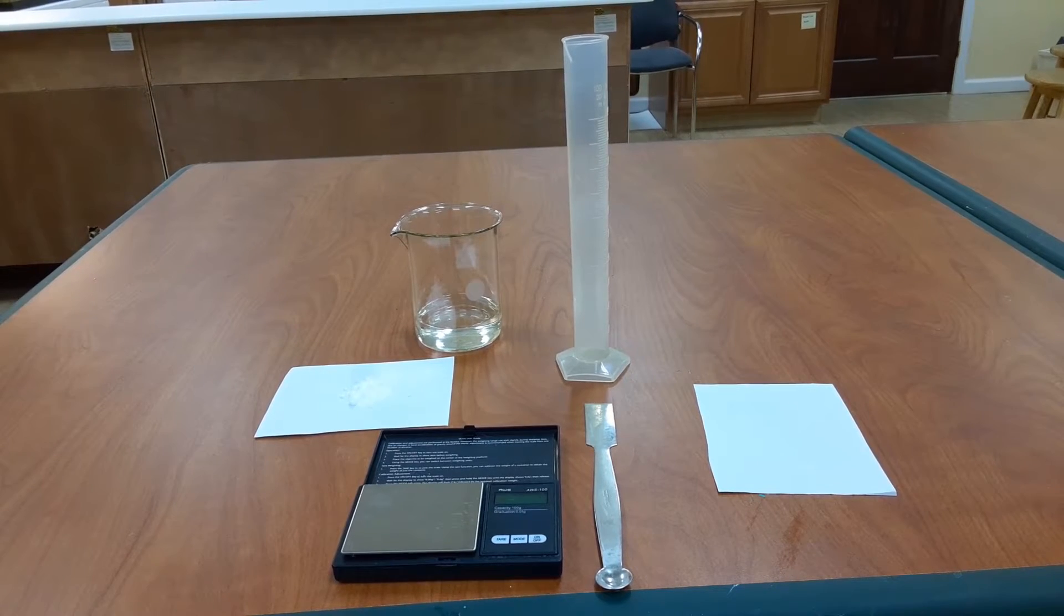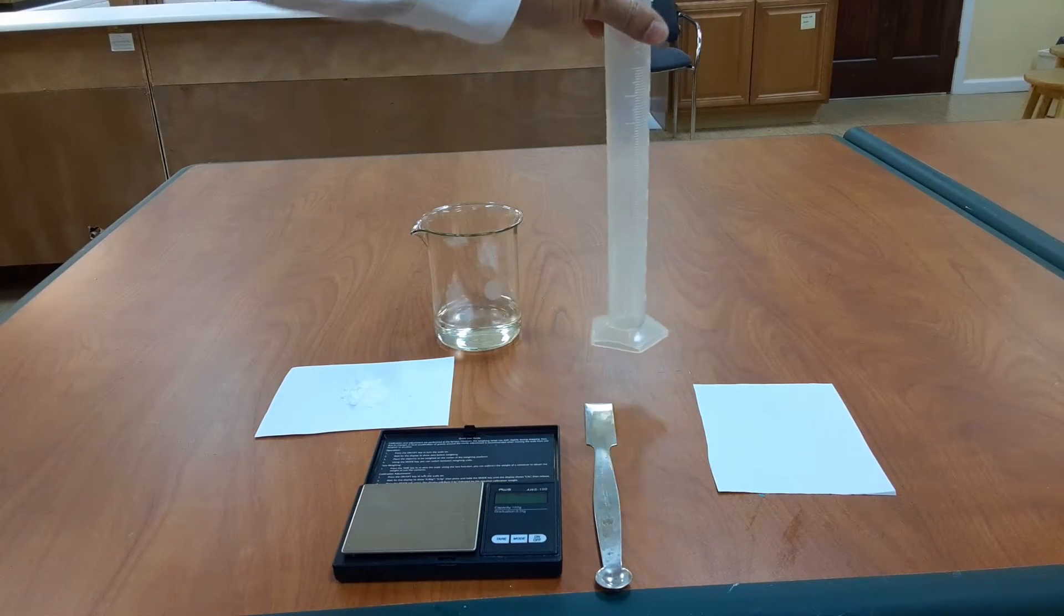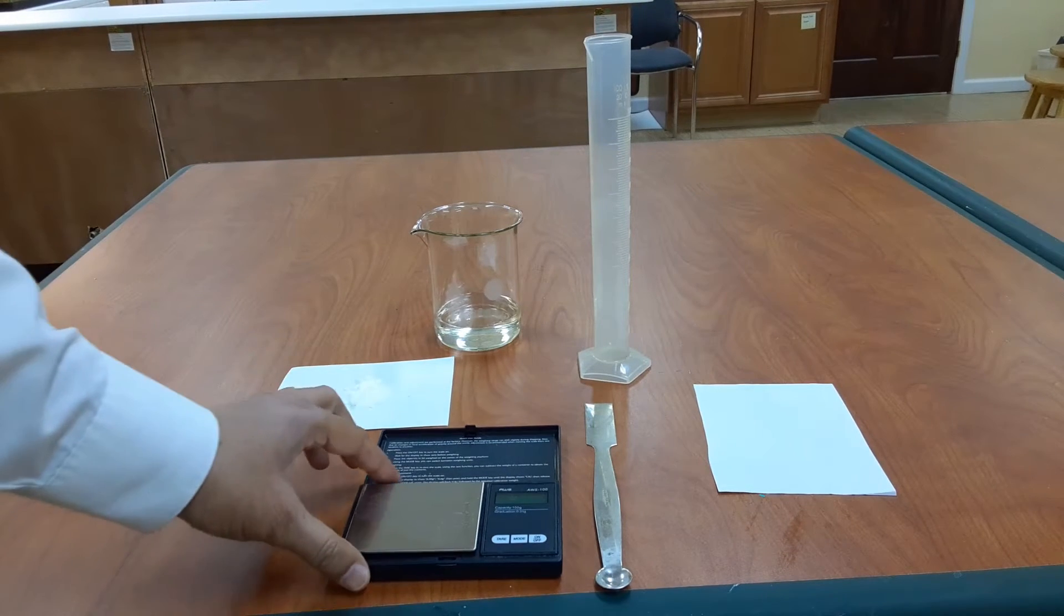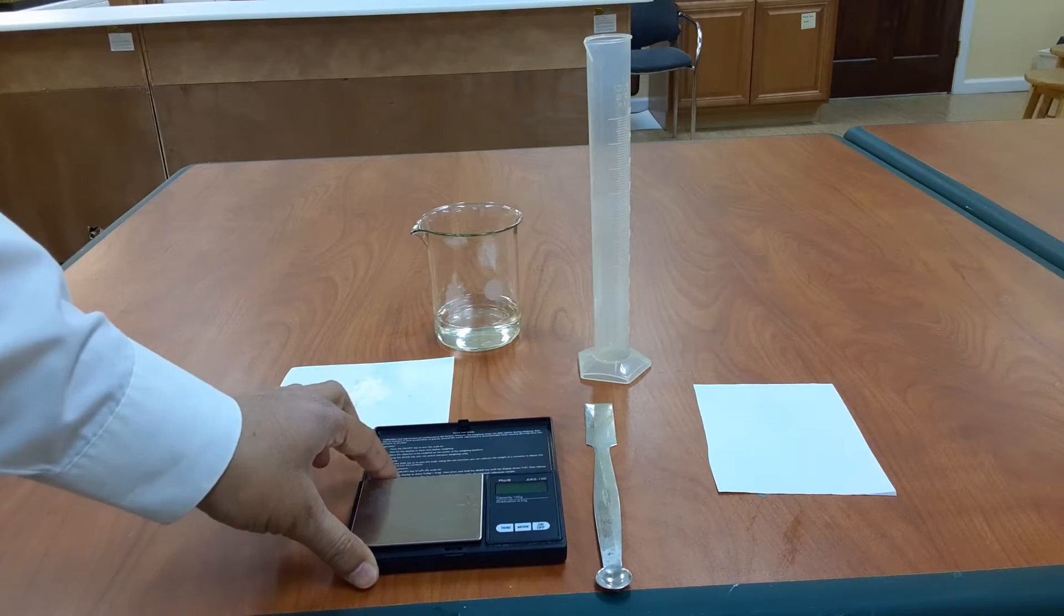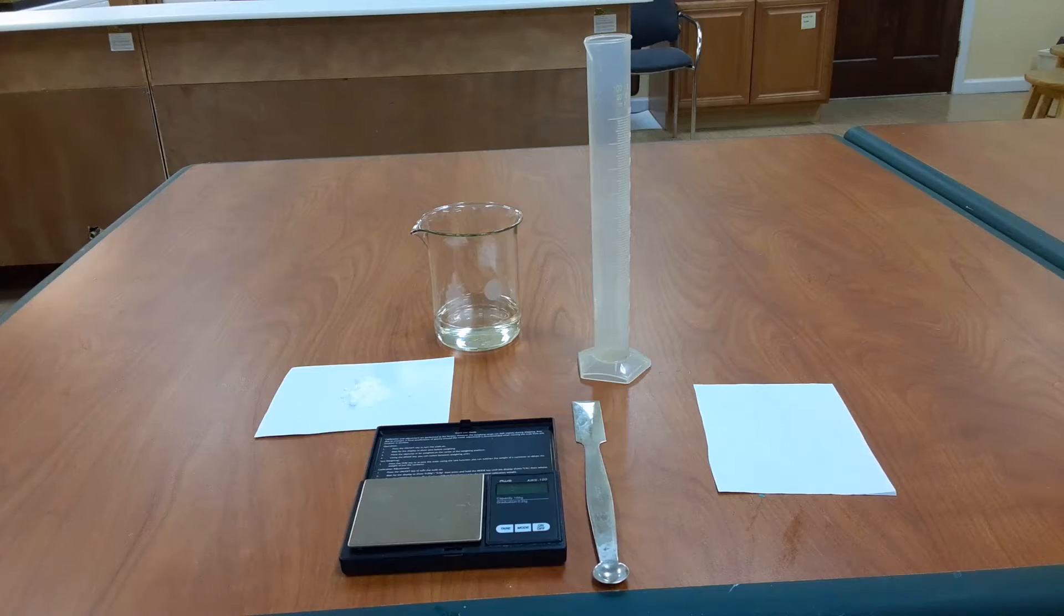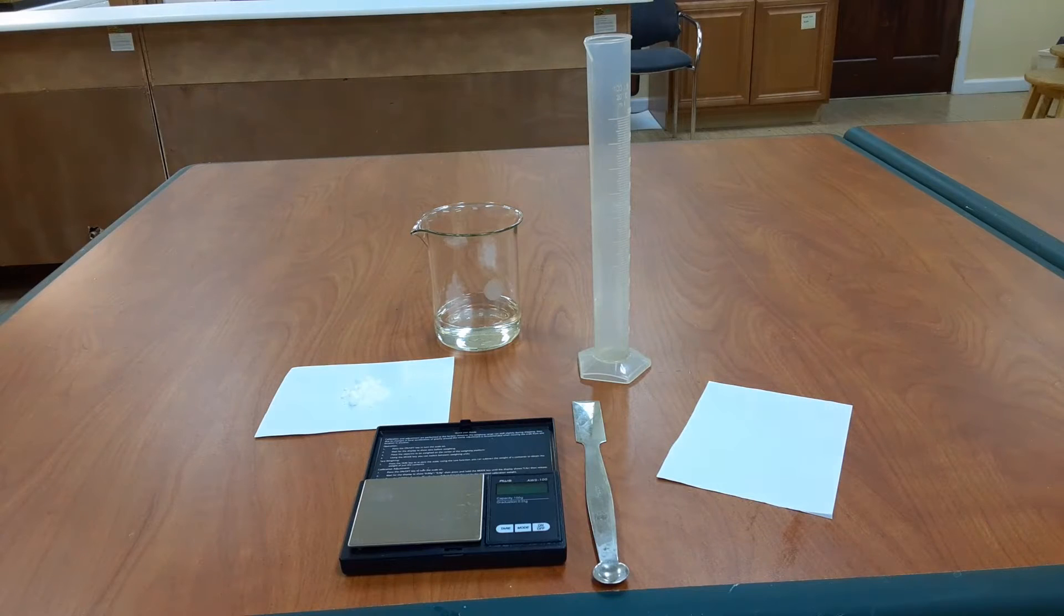Here I have everything I'm going to need for this lab. I have some vinegar in a beaker, a measuring cylinder or graduated cylinder, some baking soda on a piece of paper, my digital balance for measuring masses, a spatula for transferring the baking soda, and this additional sheet of paper which I will use to measure the mass of baking soda. Once we have everything we need, we can get started and start making some measurements.